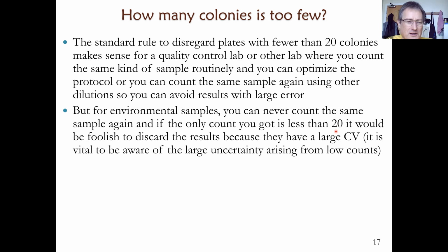10, or 100 CFU per milliliter at different times. So a wide range. So the count changes a lot. If you're taking the geometric mean of this, which is the product of the individual CFU values, so 1 times 10 times 100, and then taking the nth root of this, we get 10 CFU per milliliter, which is exactly the middle value, if you like.